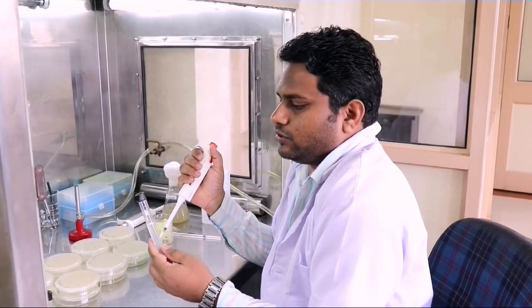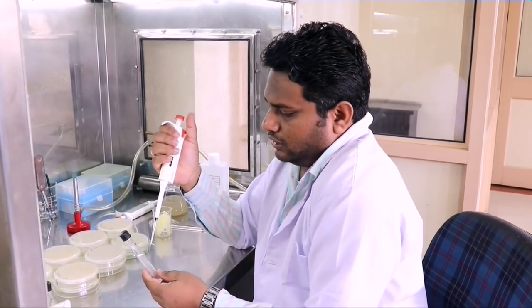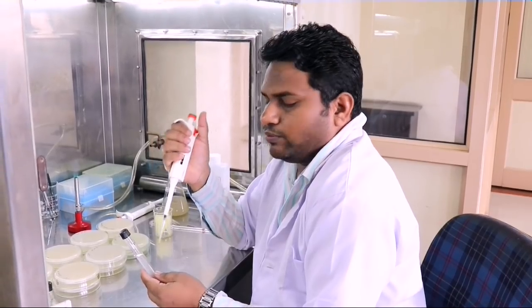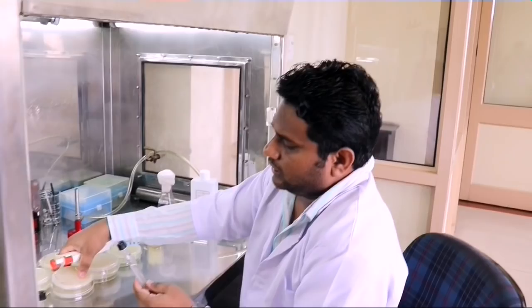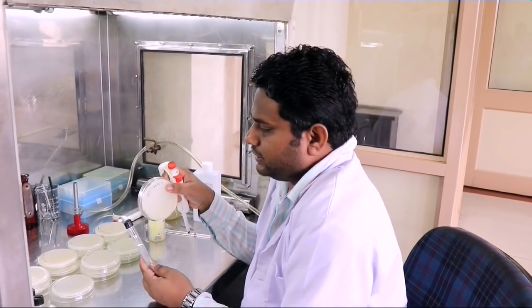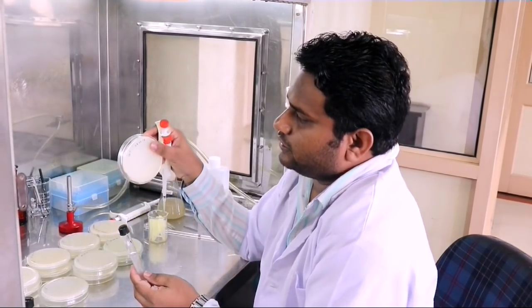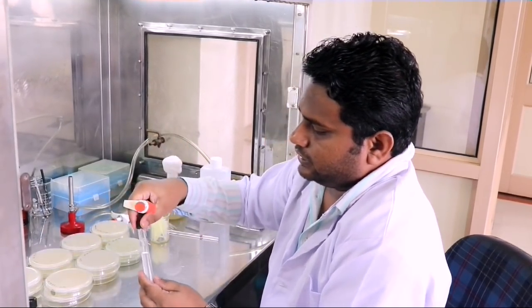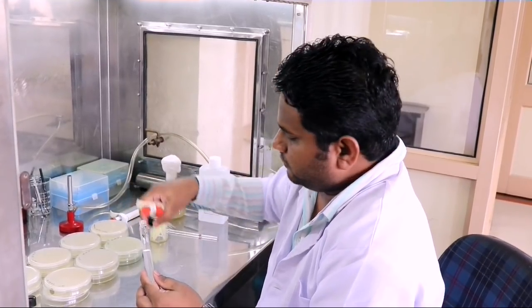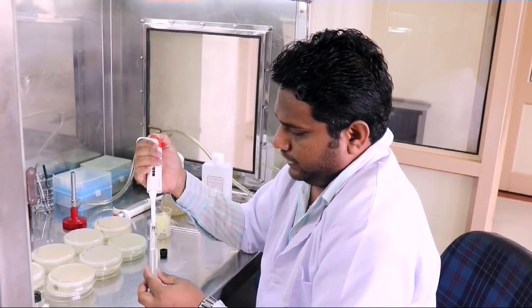Now this is the 10 to the power of minus 1 dilution. We are taking an inoculum of 0.2 ml and will be adding it to the corresponding plate labeled 10 to the power of minus 1. So today we are doing that — that is why the date is mentioned. Now let us inoculate from the 10 to the power of minus 1 to the corresponding plate.